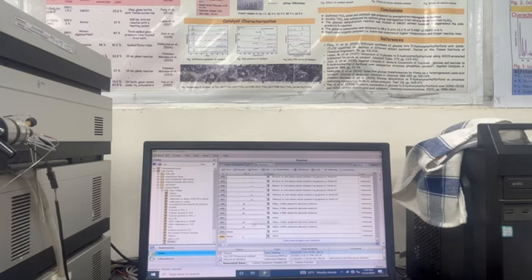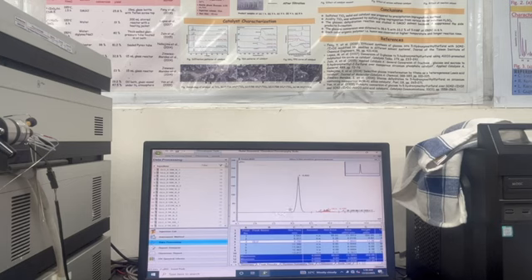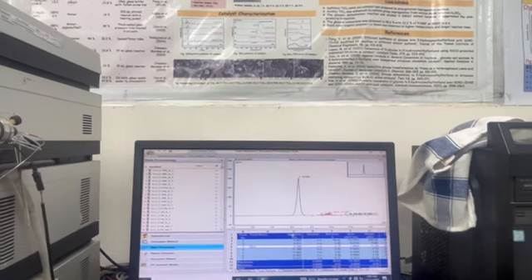After starting, you will go and inject it, and when it shows waiting for your sample, then the analysis will continue. Okay, once your run time is over, you will get this kind of peaks, depending on your sample. And if you label it, like I said, in the processing method, it will show you the name. Or if you don't label it, on your test runs, you will know at which retention time. Here it shows the retention time.